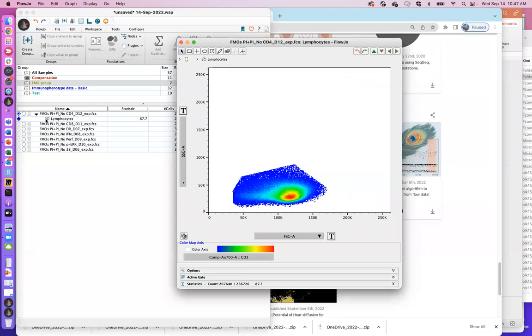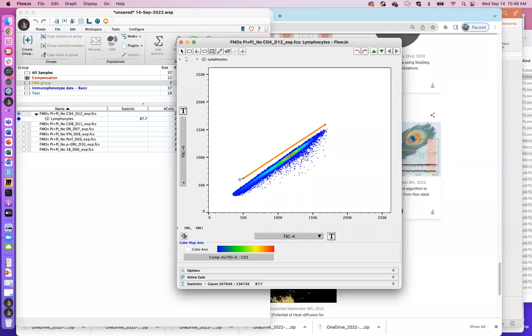You'll notice that the minute you create a gate, it gets this little petri dish, they call it. Some other students have called it a Yoshi egg, sitting next to the actual gate name. From there, you can visualize that population and put some other parameters. I like to start with a tissue specific gate. Then I might do maybe some doublet discrimination. You could do viability dye, whatever. I'm going to do it in this particular order. We'll call this single cells, which is fine. Double click on this.